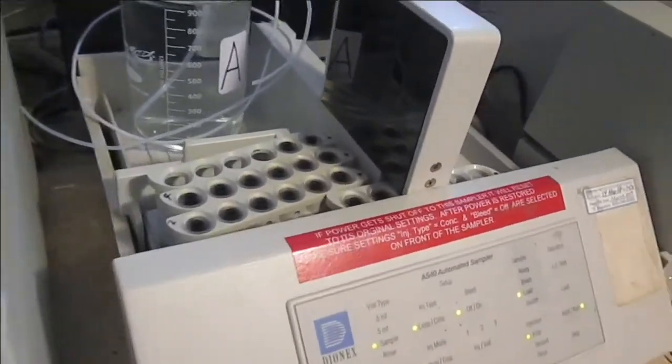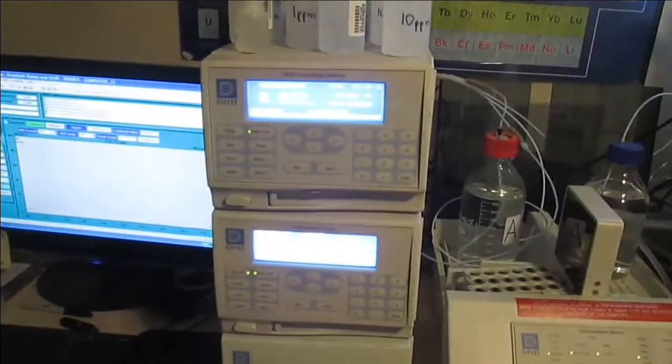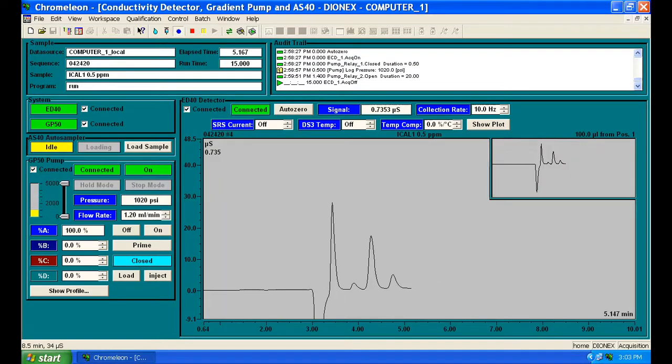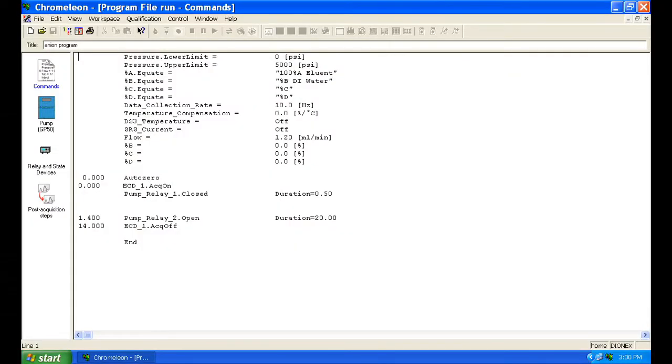Hello and welcome. In this video, I'll try to make use of my equipment and analyze some commonly found items for a variety of analytes. Because it was set up this way when I started this video, and also because I struggled to find the right concentration of mobile phase in the programming, I'll start with the anion in water samples, which is easier.